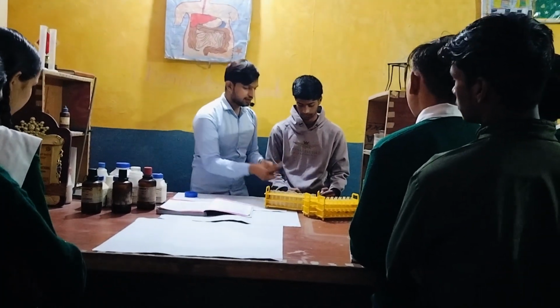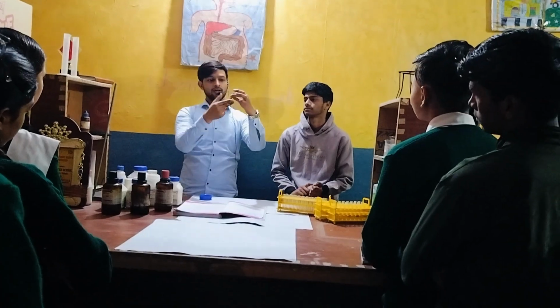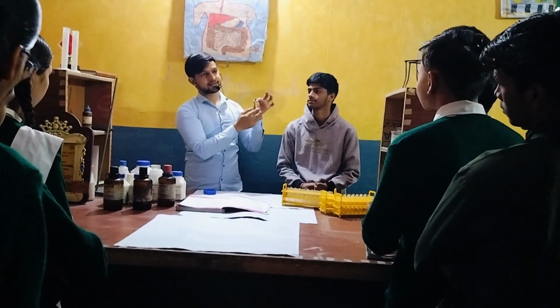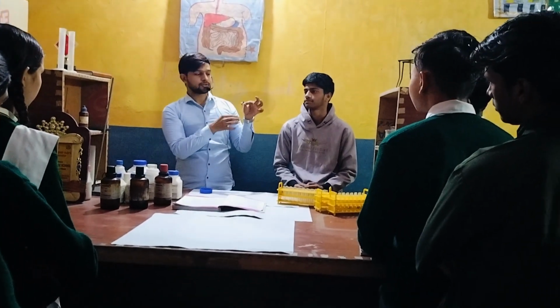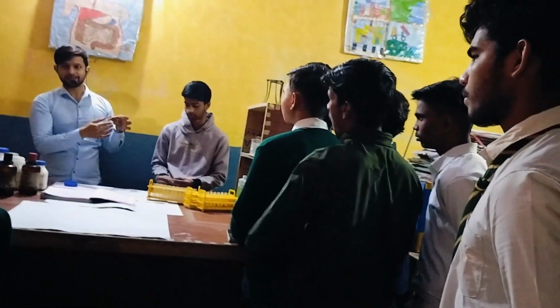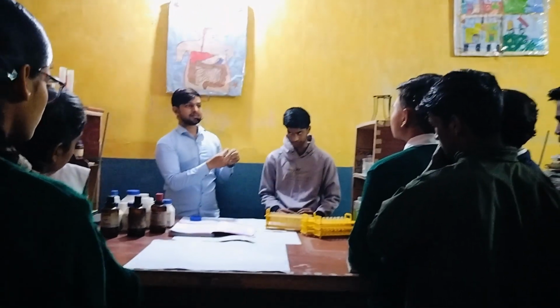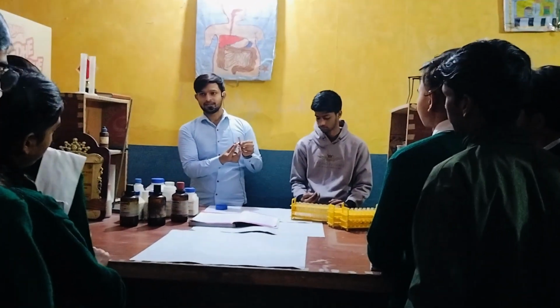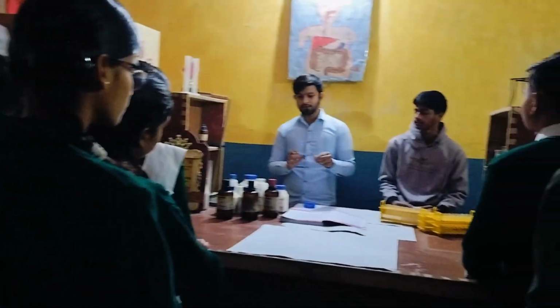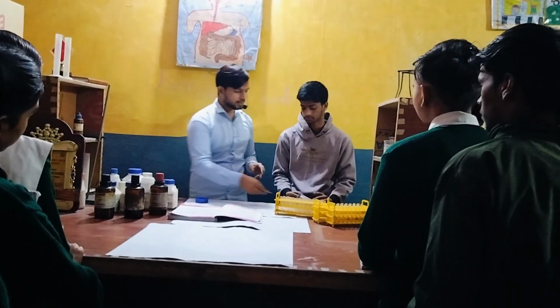Next, we have some papers. This is pH paper. As you can see, the scale is given at the start, and according to the color we can calculate its pH value. Next, we have red litmus paper. It is a natural indicator because it is obtained from the lichen plant, and it is red in color.